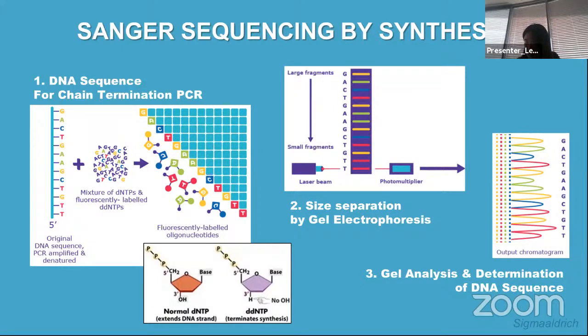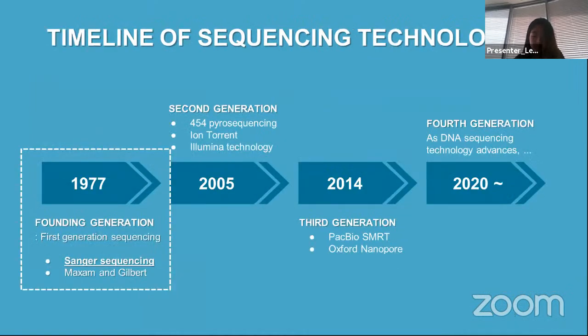Sanger sequencing uses specific chain terminating nucleotides, the dideoxynucleotides that lack a 3' OH group. Thus, no phosphodiester bond can be formed by DNA polymerase, resulting in termination of the growing DNA chain at that position. The ddNTPs are radioactively or fluorescently labeled for detection in sequencing gels or automated sequencing machines. The Sanger sequencing method was developed in 1977.